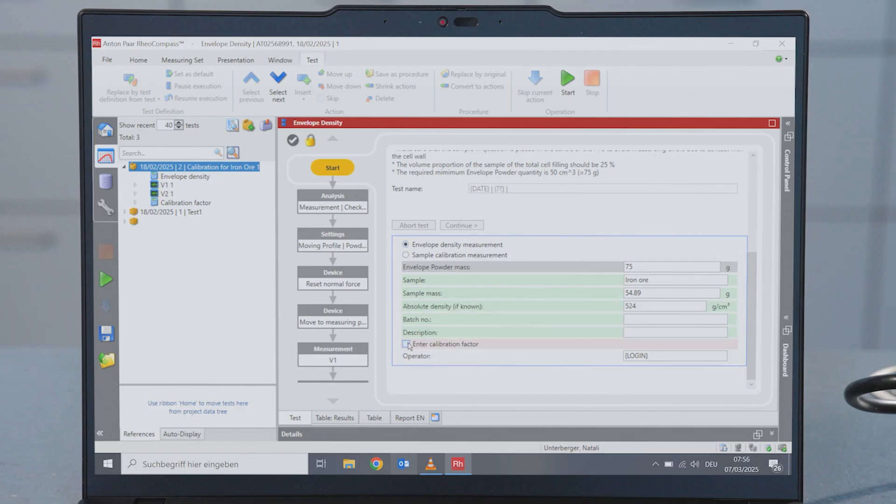Apply the calibration factor to subsequent sample measurements. Averaging the calibration factor results of multiple determinations further improves the final results.